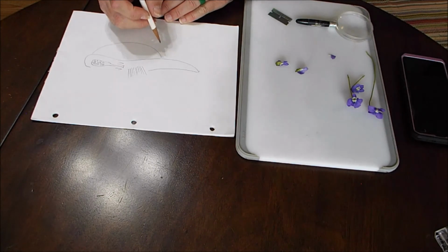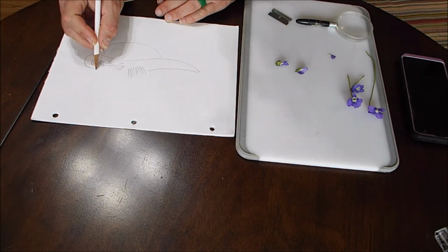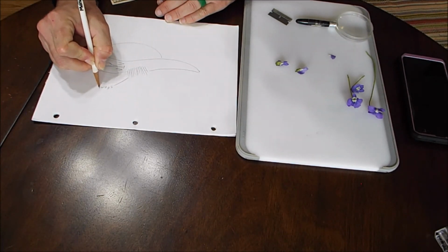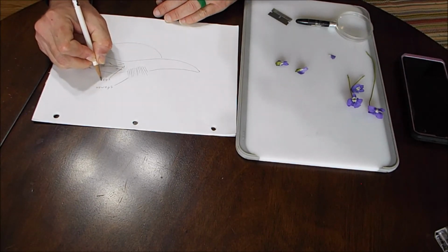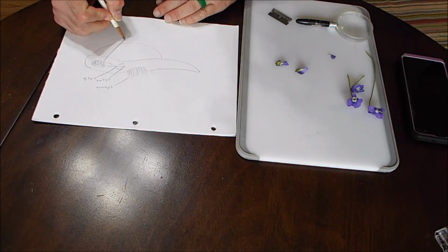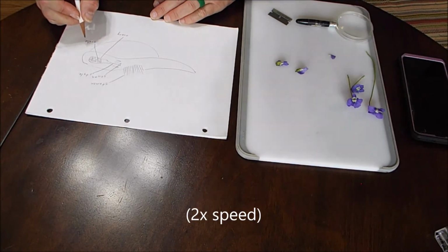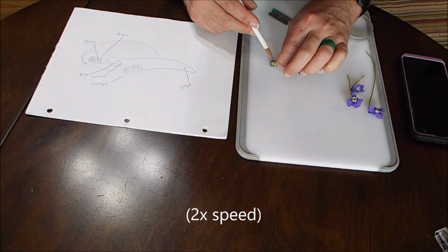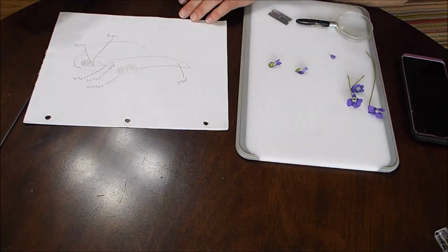Now it's the labeling time. And how am I going to do this? I guess I need to finish up my little drawing here, which kind of goes like that. And those will be stamens. And that is stigma, style. And we'll leave some room here, and I'll do, that's ovary or ovary wall. Don't really care. And then ovule. And I'm not done yet because this is a petal. I should have drawn a straighter line than that. And there's a tiny bit of sepal in here, but I'm just going to leave that out for clarity. So there we have the final drawing.